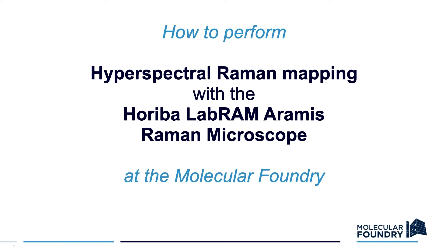In this video, you'll learn how to acquire a hyperspectral Raman map using the Hariba Labram Aramis Raman microscope at the Molecular Foundry, Lawrence Berkeley National Lab.